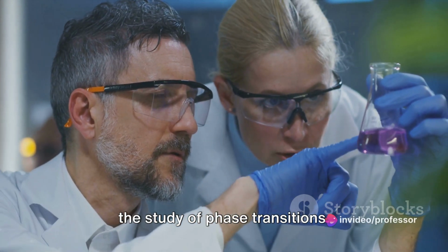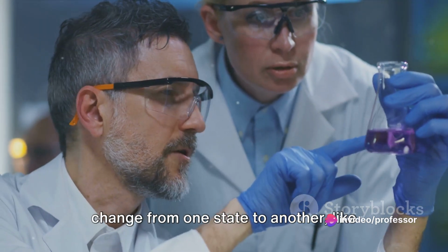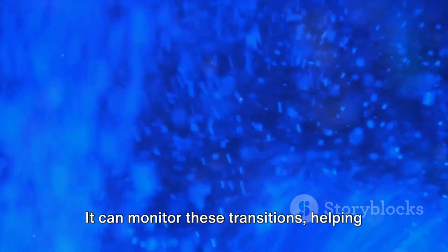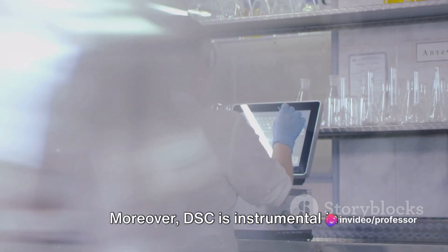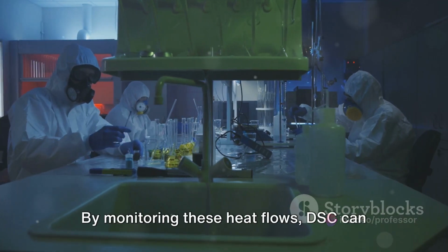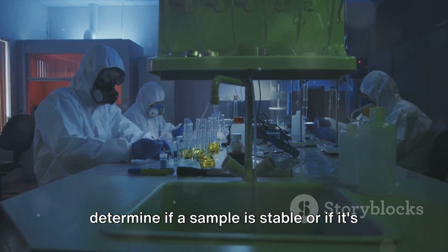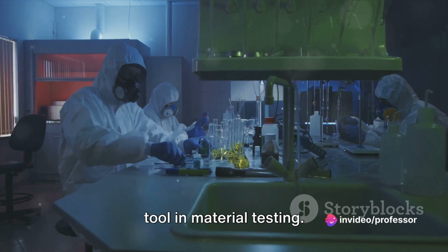Next, we have the study of phase transitions. If you've ever wondered how substances change from one state to another, like from solid to liquid, DSC is your answer. It can monitor these transitions, helping scientists understand how and when these changes occur. Moreover, DSC is instrumental in determining the stability of a sample. It's all about heat, how much a sample absorbs or releases. By monitoring these heat flows, DSC can determine if a sample is stable or if it's likely to decompose, making it a vital tool in material testing.